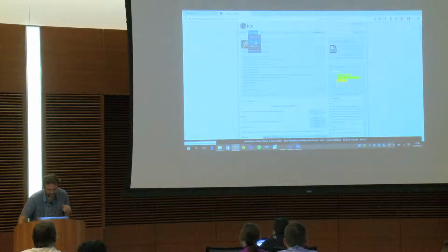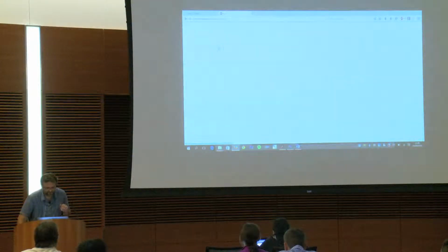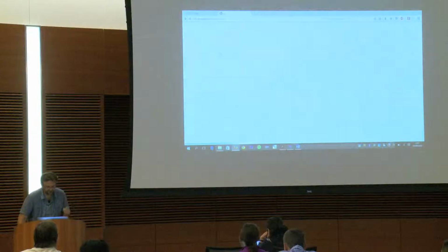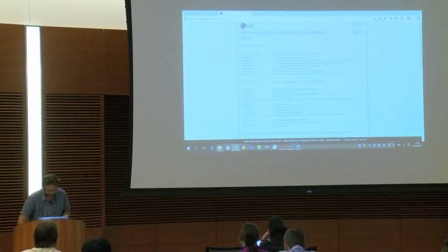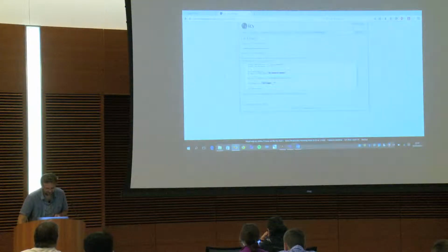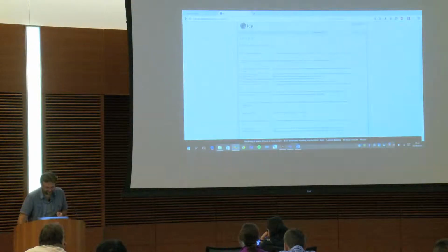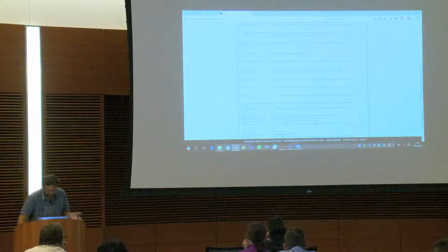Just a quick tour. You have all the resources here. So the plugin list with all the current plugins that we have. You have all the scripts, and you can even see the look of the script. Let's say I want to call an ImageJ plugin. So you have the script that is here, and you write image.run, and you can have your ImageJ plugin working. And you have also the protocols. So it is a graphical programming. If you want to do, let's say, the same thing with ImageJ.